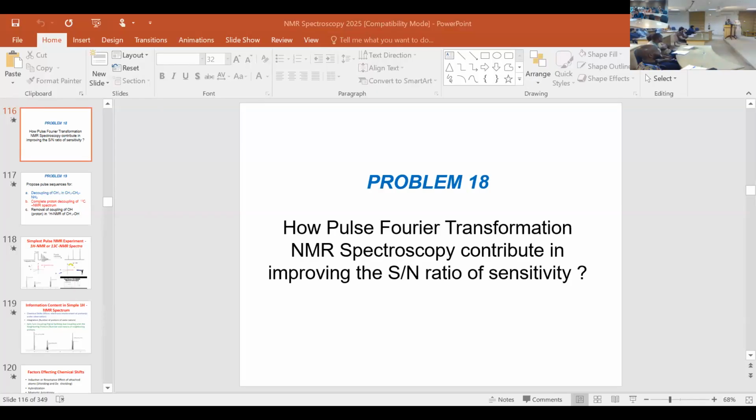Fix the problem, can you kindly explain what is signal to noise ratio or sensitivity? Sir, as you mentioned in your previous lecture, signals are always overlapping.